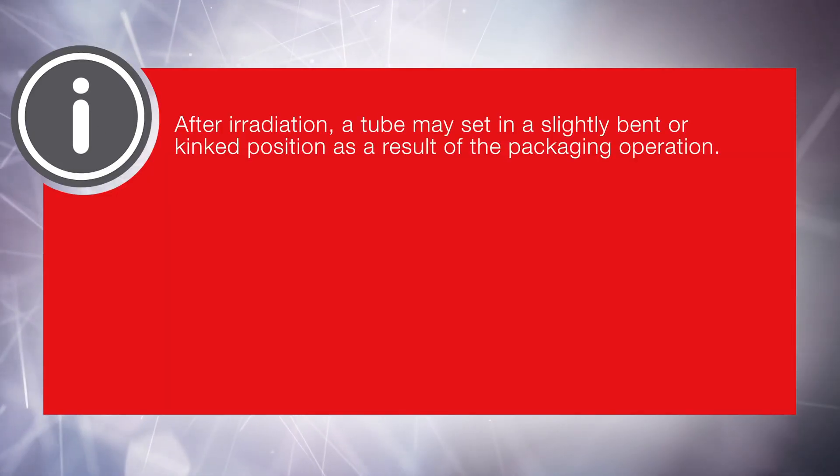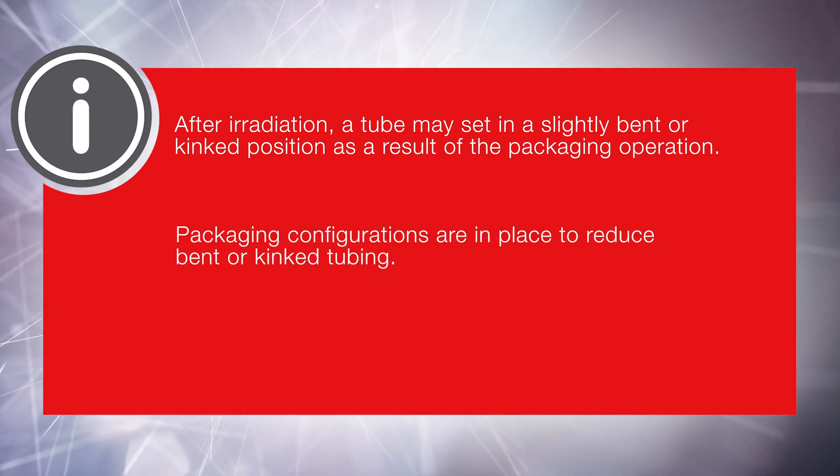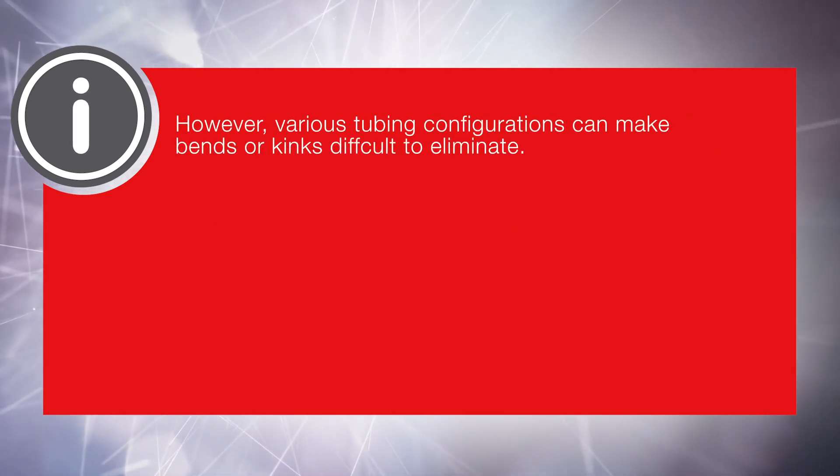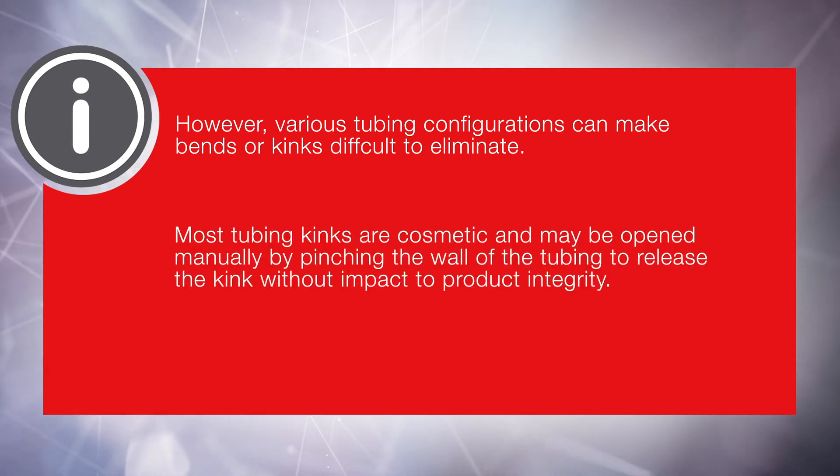After irradiation, a tube may set in a slightly bent or kinked position as a result of a packaging operation. Packaging configurations are in place to reduce bent or kinked tubing. However, various tubing configurations can make bends or kinks difficult to eliminate. Most tubing kinks are cosmetic and may be opened manually by pinching the wall of the tubing to release the kink without impact to product integrity.